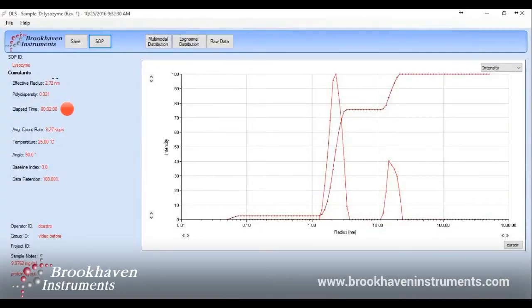Fast-forwarding to the results, they show a radius of 2.72 nanometers for lysozyme. We see multiple populations, a large one at around 15 nanometers. The effective radius is calculated using all populations detected, so this large population is pushing the radius above the known radius of 1.89 ± 0.025 nanometers.